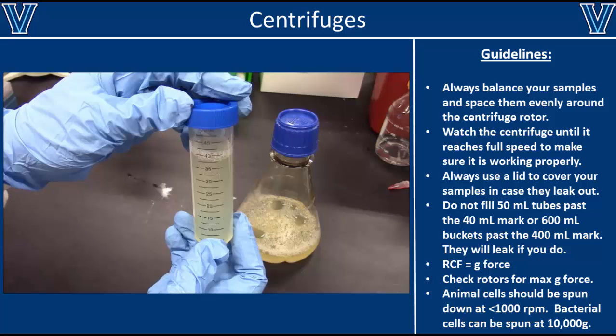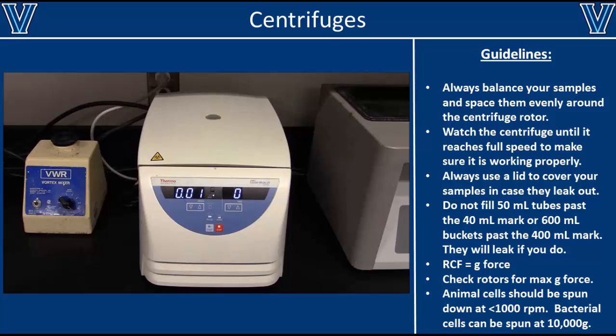So to prevent making a huge mess that you have to clean up in the centrifuge, only fill up 50 ml tubes to 40 ml and fill 600 ml buckets to around 400 ml. So just to review, when using a centrifuge, always make sure that your samples are properly balanced. When using 50 ml tubes or large buckets, only fill them to 80% of their maximum volume to prevent any spills. If a spill does occur, make sure that you clean it up immediately.